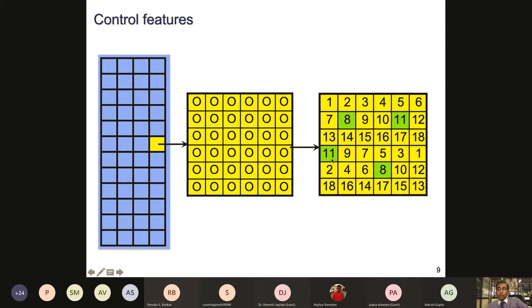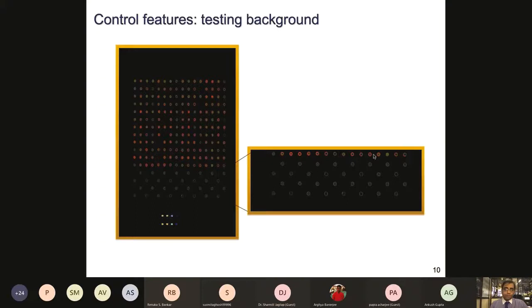And what you want is that you don't want the same proteins or the DNA to be printed next to each other, so that you have no neighboring effect. You want to have duplicates for reproducibility, like one across the corner and another in the corner diagonal. This is something you should keep in mind: your duplicates should not be next to each other.